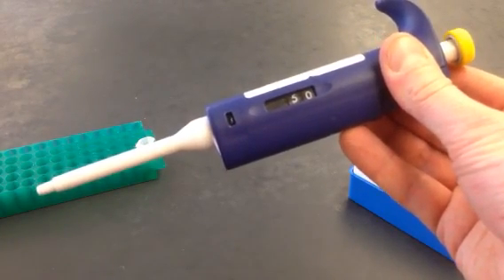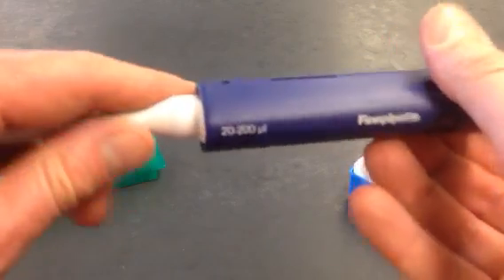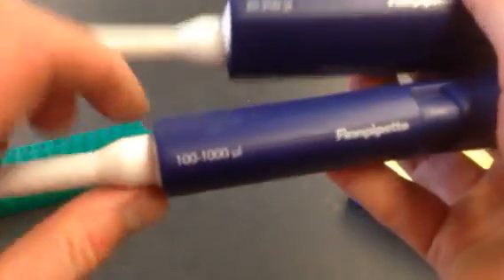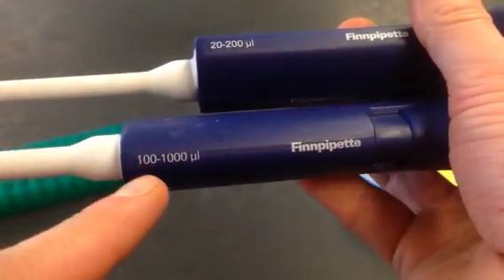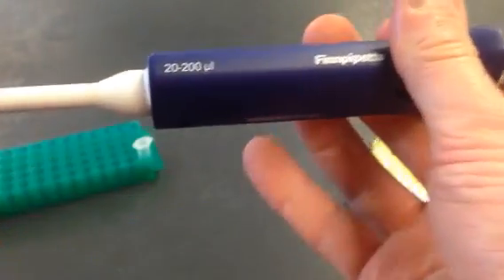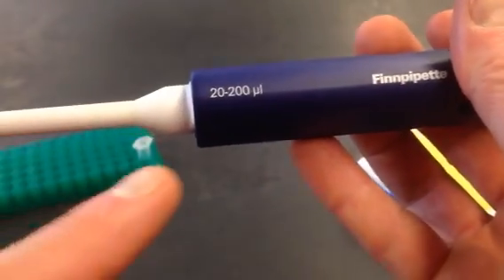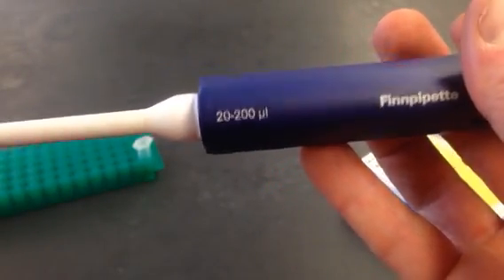This is a micropipette, and learning to use these micropipettes accurately is important for the next couple of labs. The first thing you want to make sure you do is use the correct one. I have two here that measure different volumes. This one only goes from 100 to 1000 microliters, and this one goes from 20 to 200 microliters — and this is the one we need because we're going to measure out 40 microliters right now.